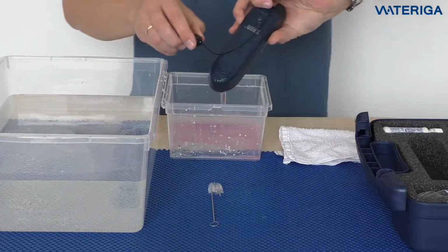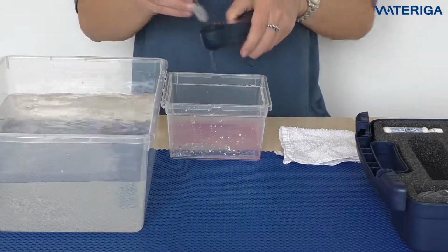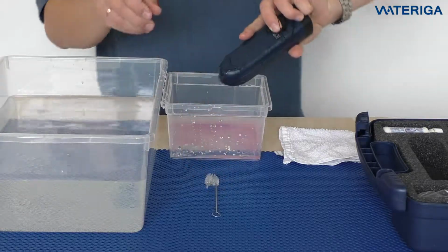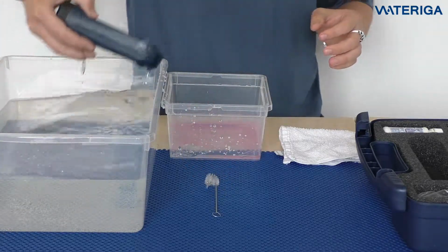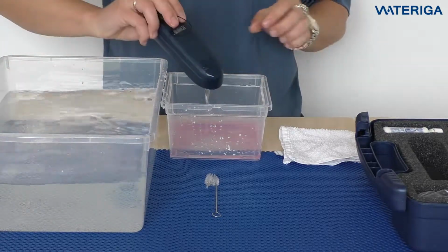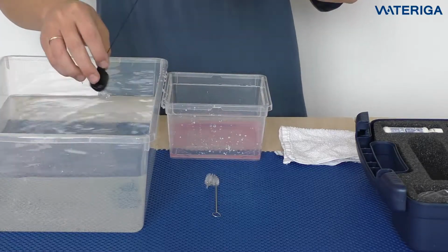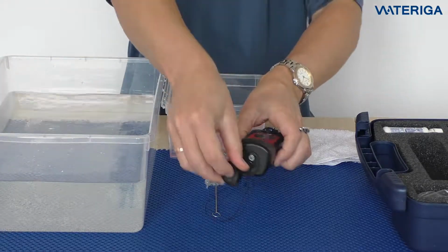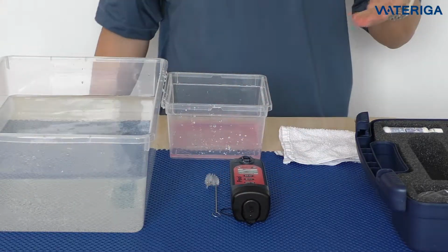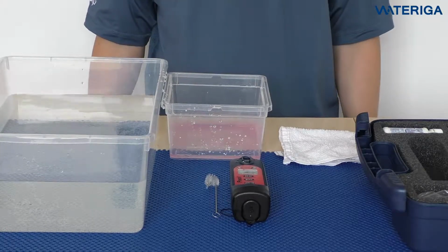Then we can dump the water. Clean it out with the brush again. Rinse it 3 times. Rinse the cap. And that's it. You can continue doing all the other tests as well in the same manner.